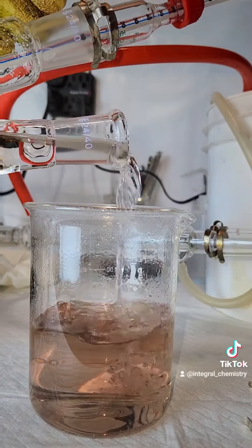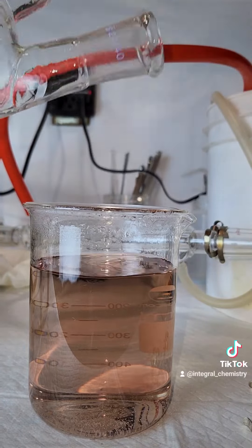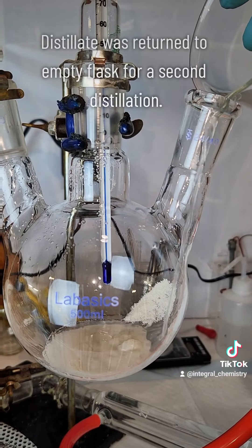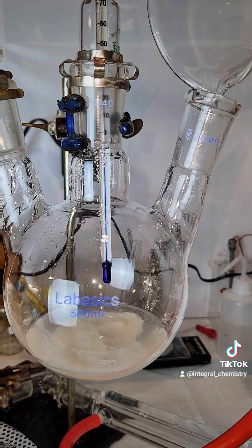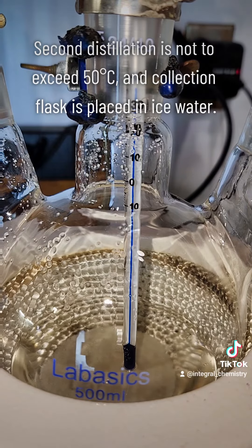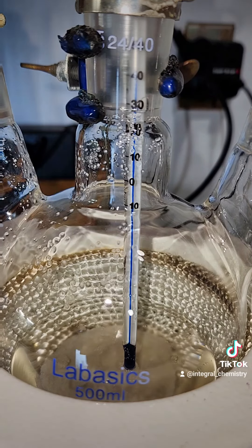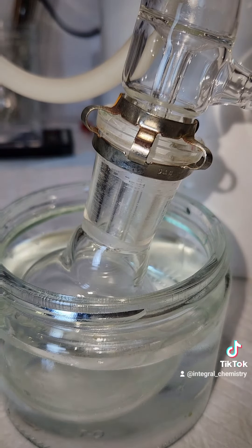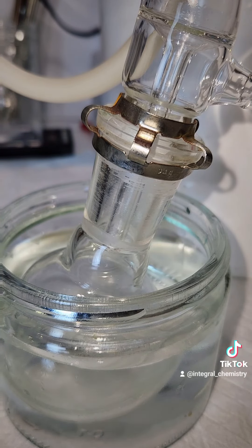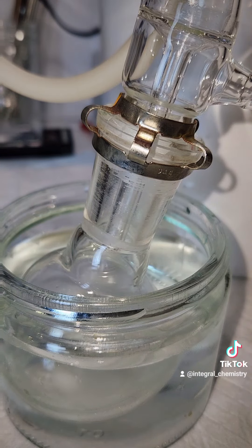Once my boiling flask has cooled down some, I empty the waste and discard it, and add my crude DCM back to the boiling flask for a second distillation. For the second distillation, I'm not going to allow my boiling flask to exceed 50 degrees Celsius, and that'll guarantee that only DCM and no chloroform is distilled over. I repeated this process with my distillate that came over below 68°C, but that one obviously didn't yield nearly as much.